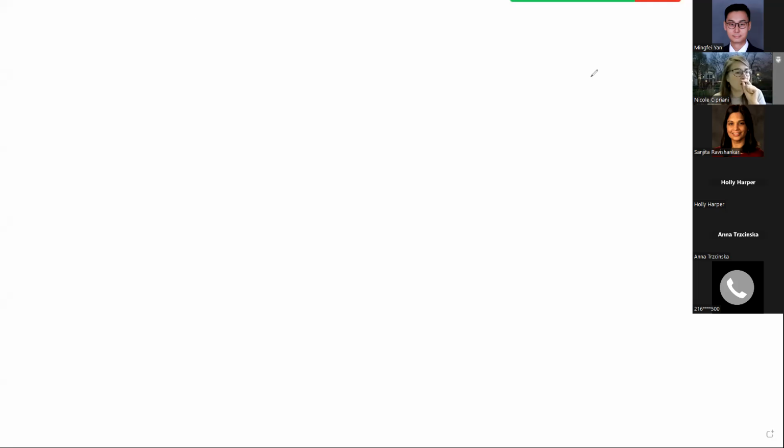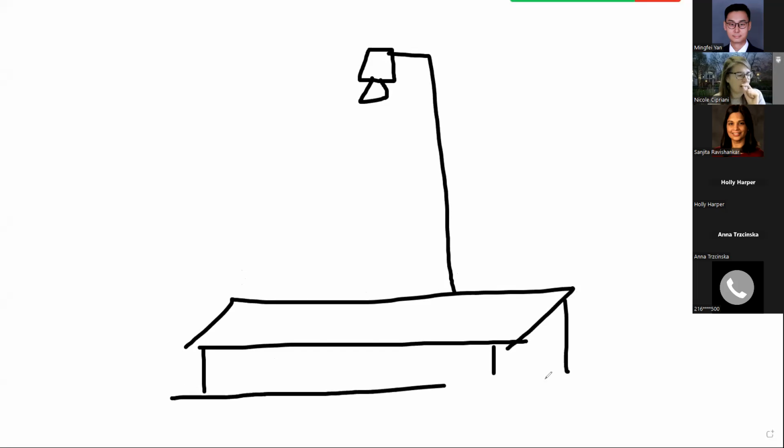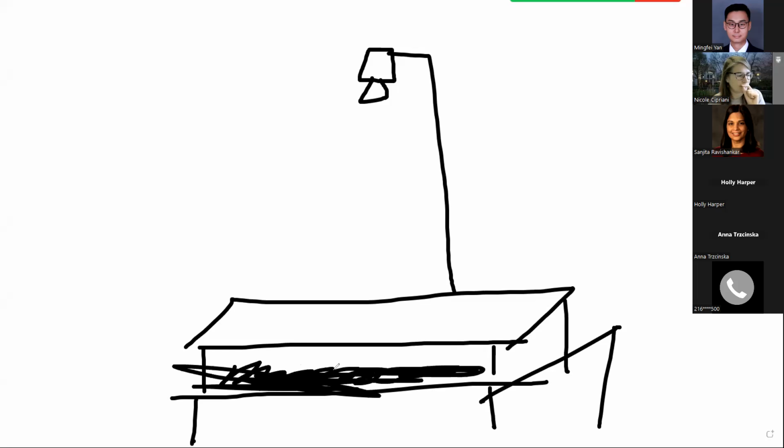Yes. Okay. So when I was a fellow at MGH, what they had was a camera on a stand, on an arm. They had a piece of glass suspended on a table, and they had a table underneath it. And on the table, there was a sheet of black velvet. All right, so the background was black as night. And then they would put the specimen on the glass.